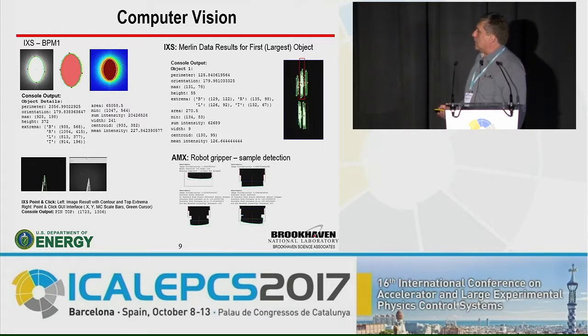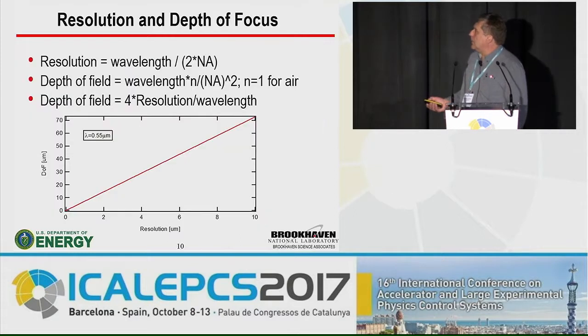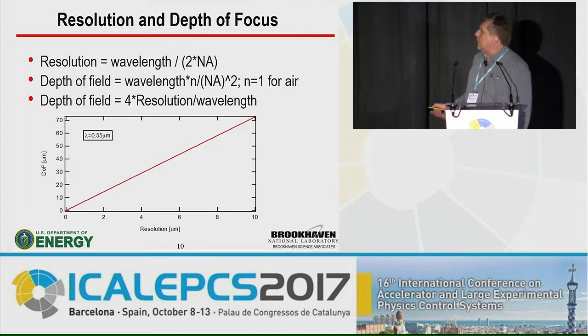This one would not be so good. It's too far from the gripper. This parameter can be used in deciding whether to proceed with the mount on the goniostat or not. It's a real-time application. Resolution and depth of focus have a fairly known relation.